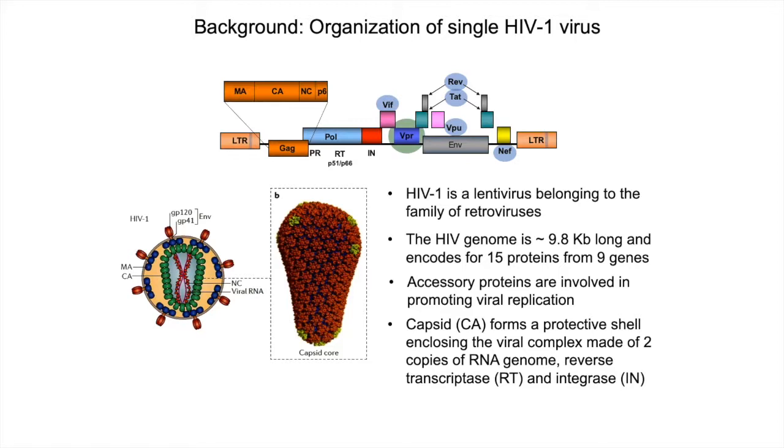Okay, so these terminologies can vary from person to person, but it definitely helps when you come to decide what you want to label in a virus, whether you want to label the core, something inside the capsid, or on the envelope. So you need to know how they are actually organized, right?